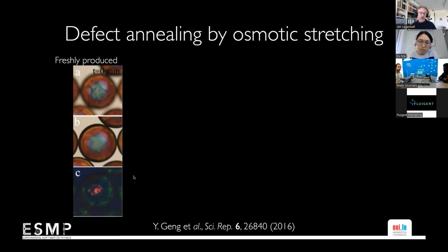And that's because this arrangement that I draw in the cartoon with a helix exactly in the radial direction, well, that doesn't happen right away, because this production process gives you a very unaligned or disordered liquid crystal shell. So this would be pretty useless for applications. But the nice thing is, because they are shells, you can actually drive water into the core from the outside by using osmosis. So the shells are not impermeable. They're immiscible with water, but they're not impermeable to water.